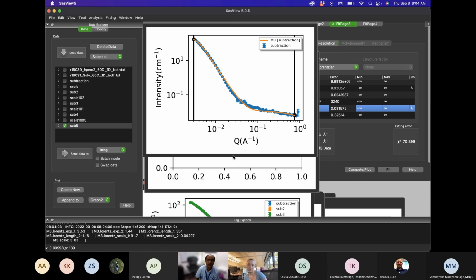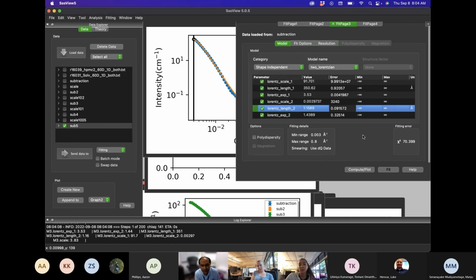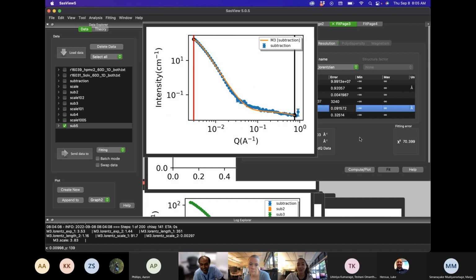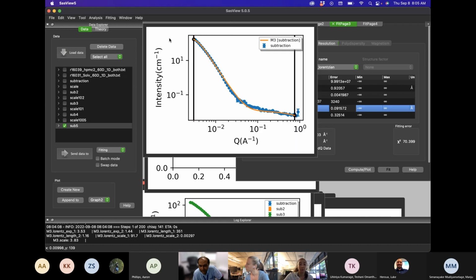Are you talking? I cannot hear you. Sorry, yes, hello. So we're having a little bit of trouble getting this aligned here. We're using a 2 Lorentzian fit, but also we've been using SASView instead of Igor. Oh, that's fine. Any software is fine. I just felt the unified fit or this combination of models was easier to show through Igor Pro. The SASView windows are a little more painful to work with. I'm not sure this is exactly the right model, but it fit pretty well for one of the different durations we're doing. But we're having trouble here with shifting.